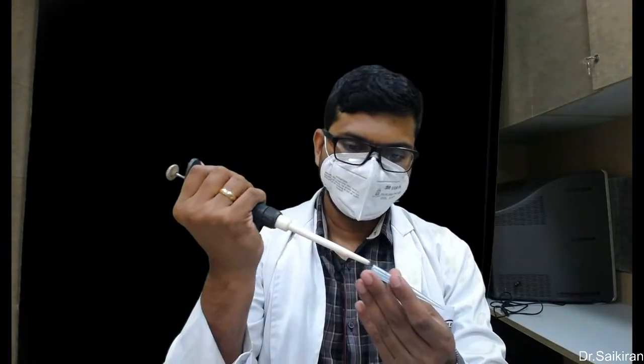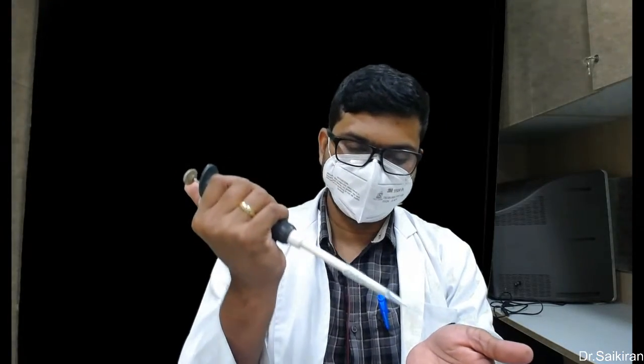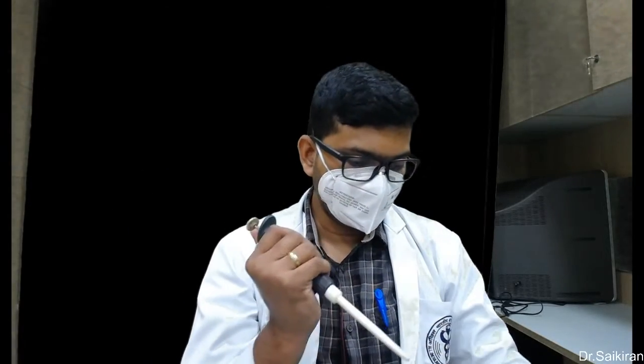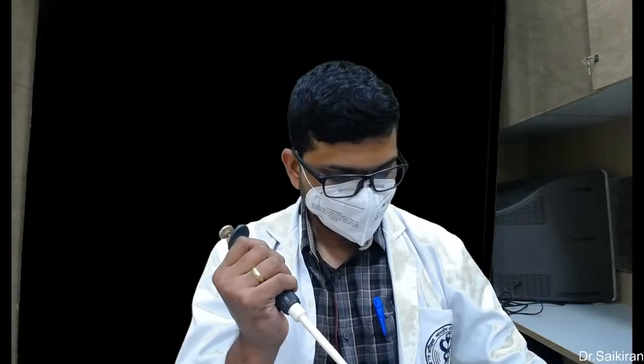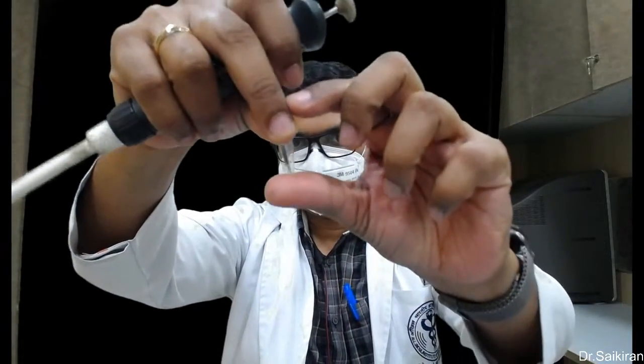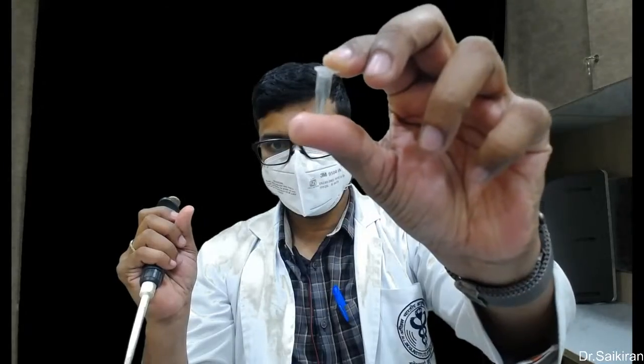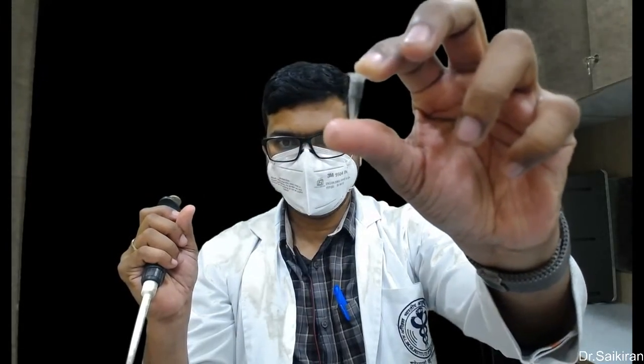We are going to use this pipette along with the pipette tips to transfer this eluate, or the product, or amplified product from one place to another place, or one chamber to another chamber, or to store. Like this is the PCR tube. I can show. This is the place where the extracted DNA is placed, and this is put into the thermocycler for amplification.